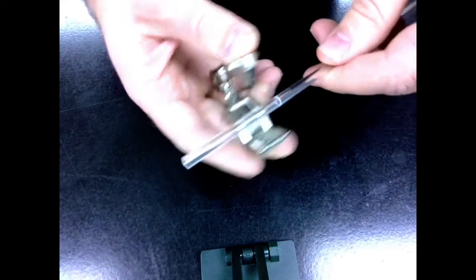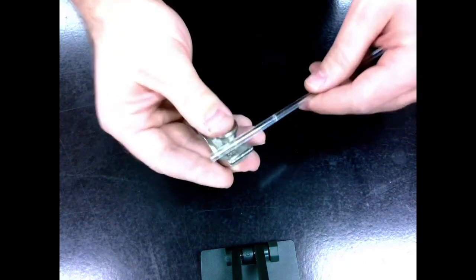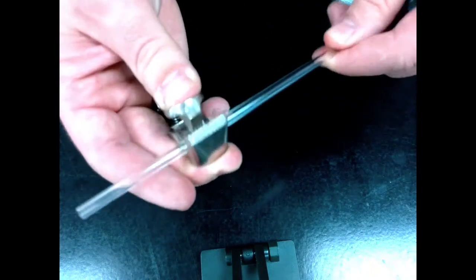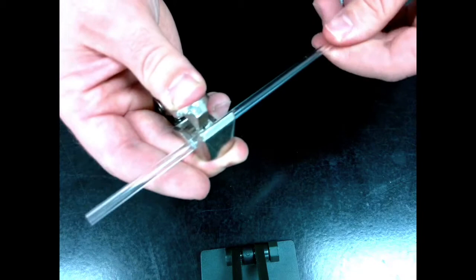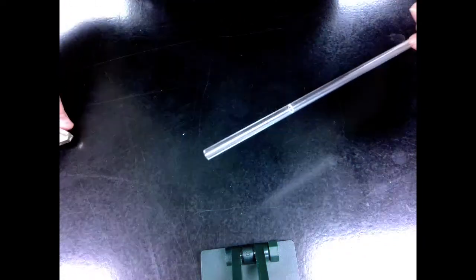Now when you're doing this, make sure you're being careful that you're putting even pressure, not too hard, because otherwise you'll just shatter the glass. And make sure that as you cut it, you are holding it in the same spot. That's why we do a small movement back and forth, because if I go all the way around each time, this glass tends to slide up, and then I start to just scratch down the glass tubing instead of getting a nice ring all the way around it.